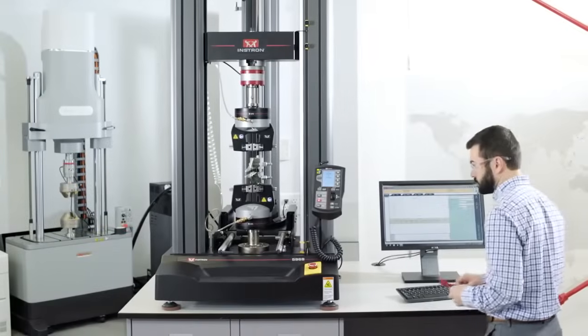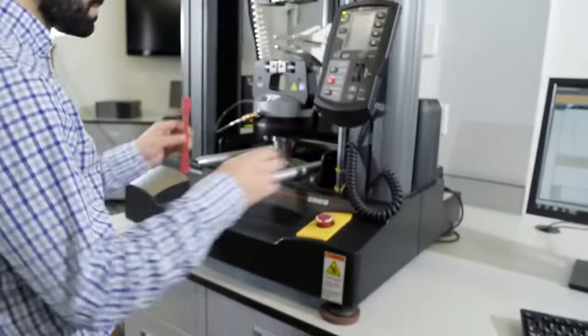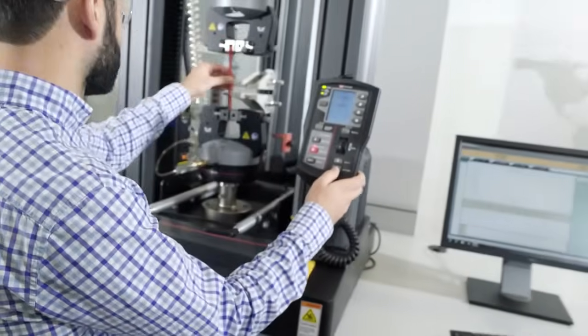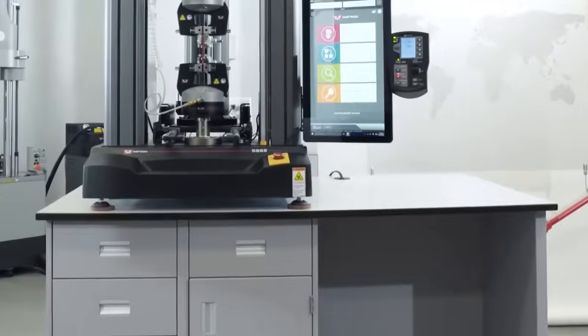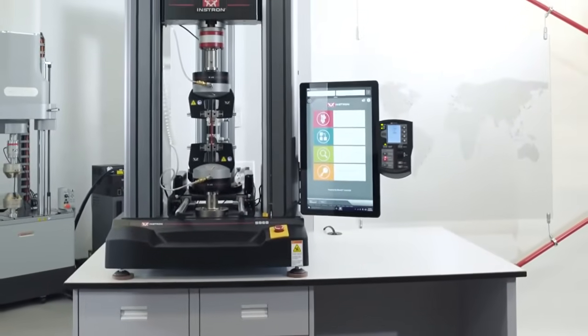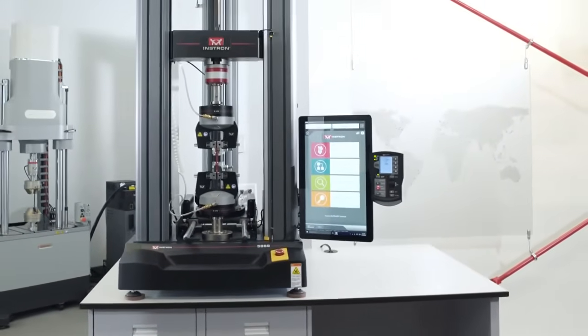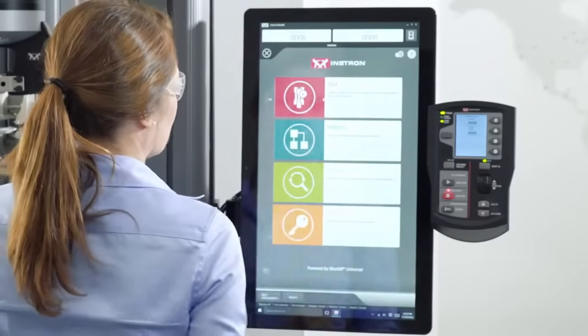Built on the success of over 30,000 Bluehill installations globally, Instron introduces Bluehill Universal, our next generation of material testing software built from the ground up for touch interaction.